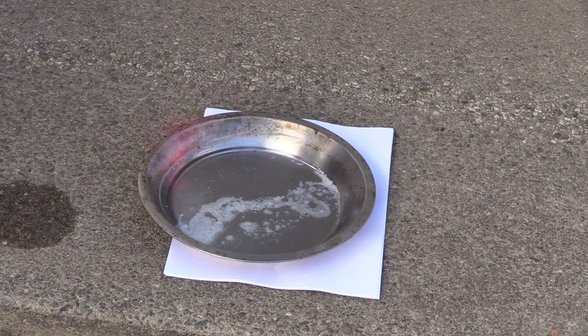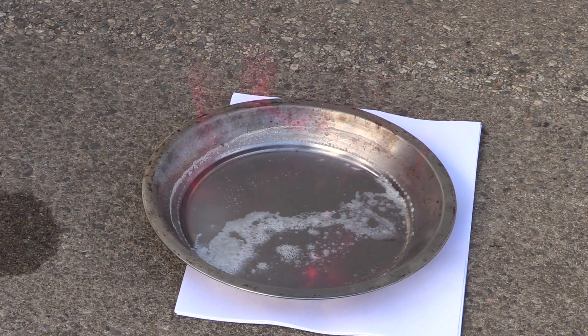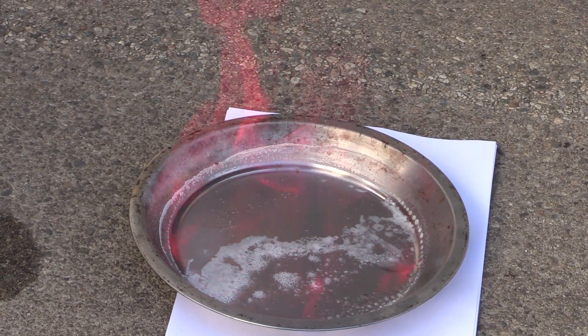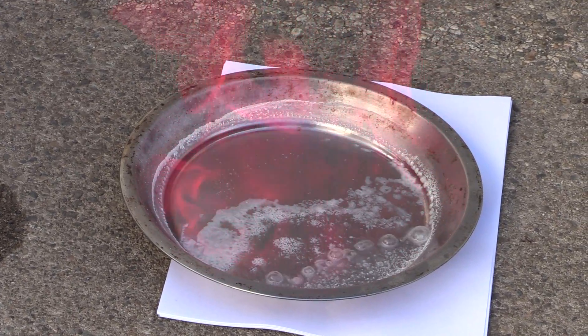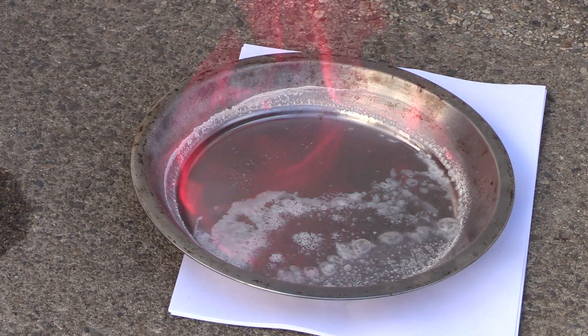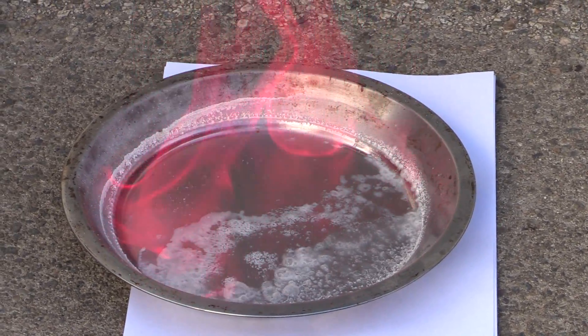Seems to catch fire. Seems almost a little better. This is the one I used in class. Isn't that beautiful? That's pretty. Now we didn't use much, so it won't last long.